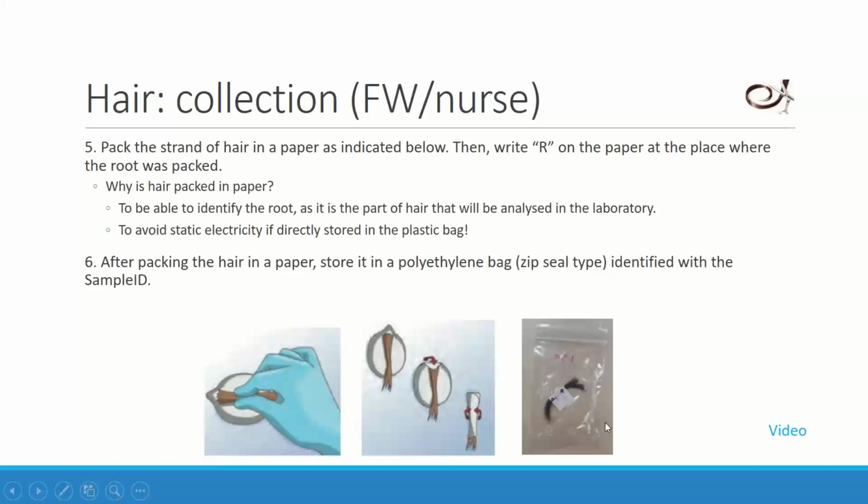And one comment, Mariana. Obviously, when the hair is short, you cannot really indicate where the root is. But the importance of indicating the root is when the hair is longer than 3 centimeters, because then we will cut it. Starting from the root, we will count 3 centimeters and the hair will be cut at that point.